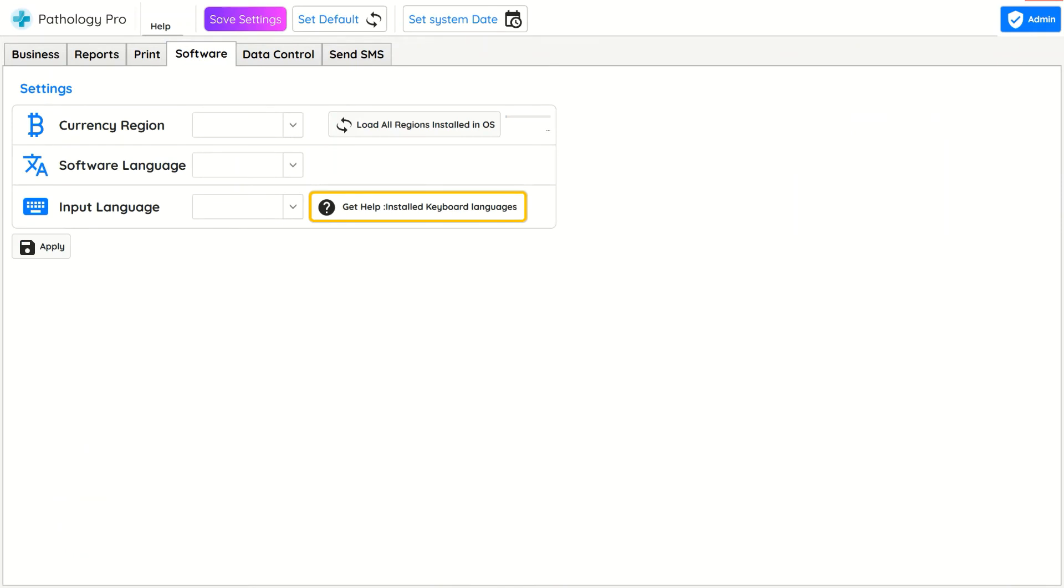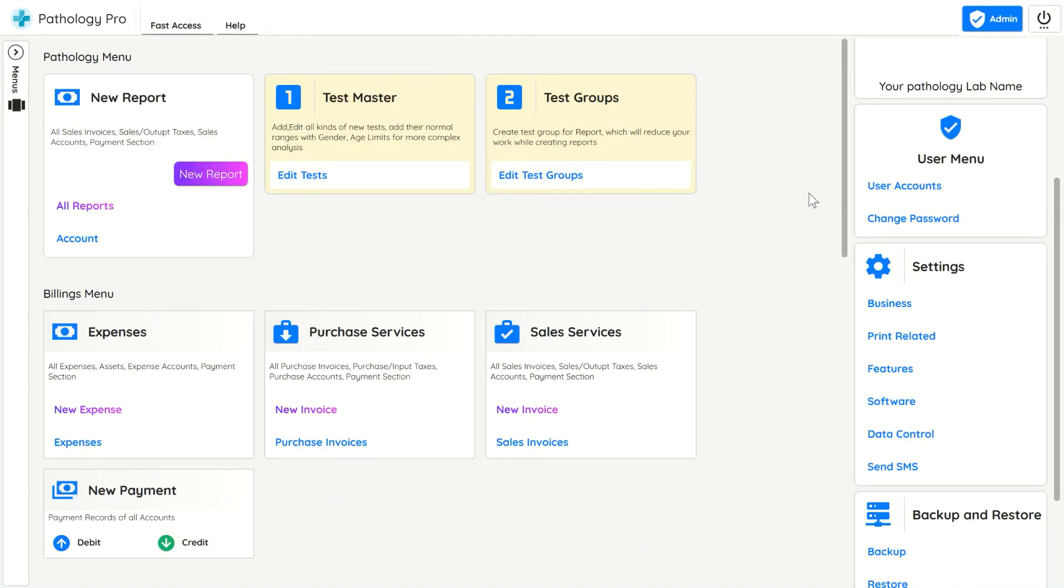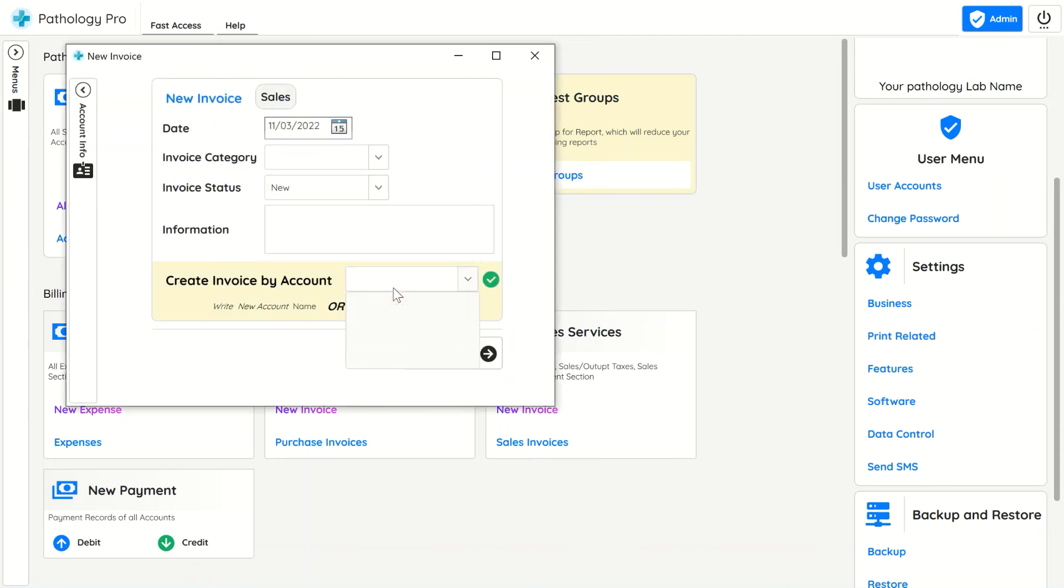For creating pathology report, click on new report, enter the patient or hospital name as account for accounting. You can add single tests or select test group to add multiple tests at once.